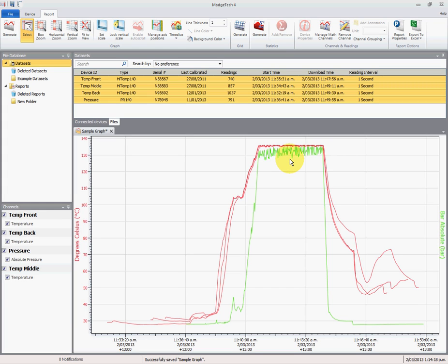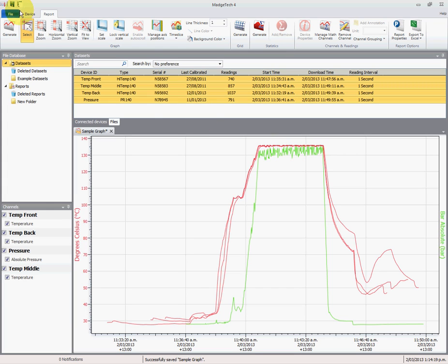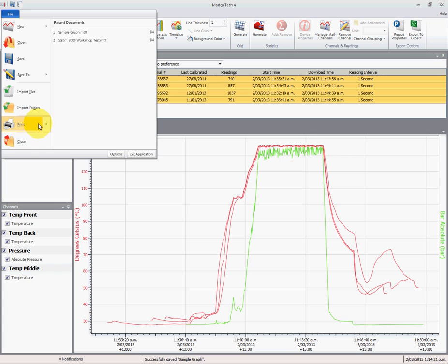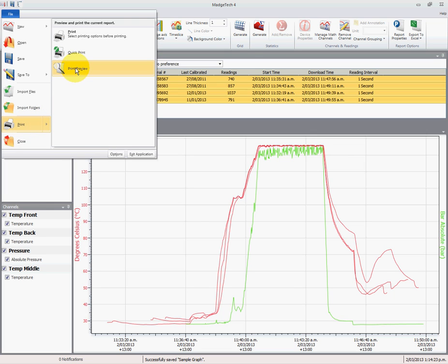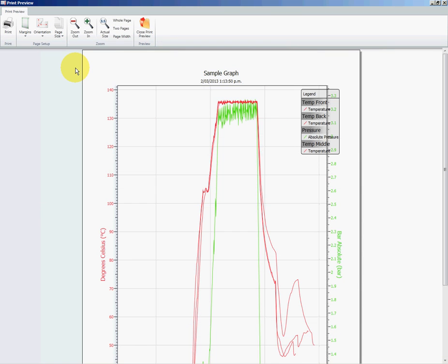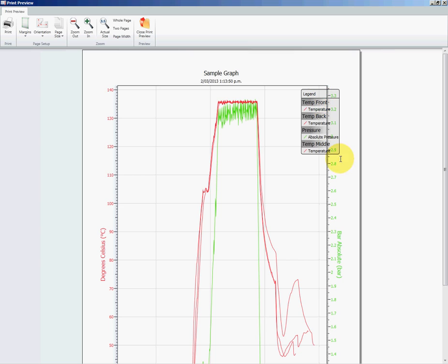So if we go to file, print preview, we'll see what this looks like before we do any changes. You'll notice on the right hand side the legend is obscured over the axis, or the axis is obscured by the legend. So we need to shift both of the axes for the pressure and temperature to be on the left hand side.